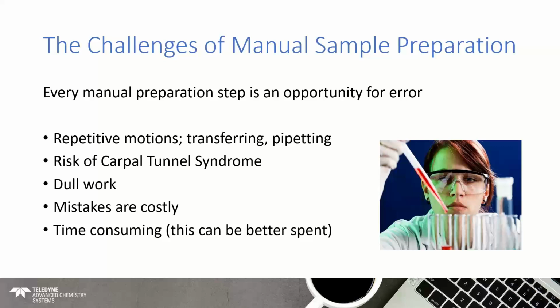It's incredibly time consuming, and this time can be much better spent by highly skilled people who typically have graduate or postgraduate degrees that are working in laboratories. There's also health concerns here as well. If you're repeatedly undertaking the same repetitive motions, there's the risk of things like carpal tunnel. So certainly things to avoid, but it is a very monotonous process, and I can attest to that.